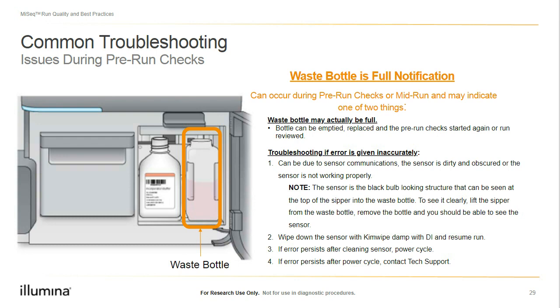If the error persists after cleaning the sensor, we may power cycle the instrument to reset the sensor communications with the instrument, and if this does not work or resolve the issue, please reach out to tech support for additional assistance.